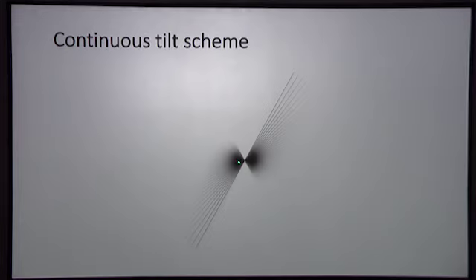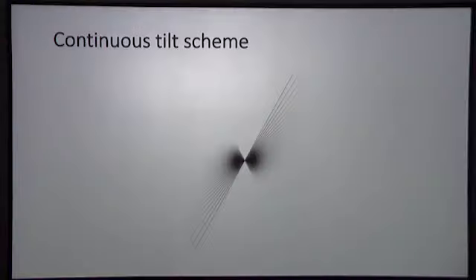What's illustrated here, if you imagine these are Fourier planes that are being added into our reconstruction, and they're being multiplied by a filter which represents the loss of information due to accumulated dose. So as you can see, the first image contains beautiful high-frequency information, and as we go through the tilt series, at some point we've applied already 80 or 100 electrons per square angstrom, and there's no more high-frequency information left. So all of this information is missing, as well as the missing wedge.